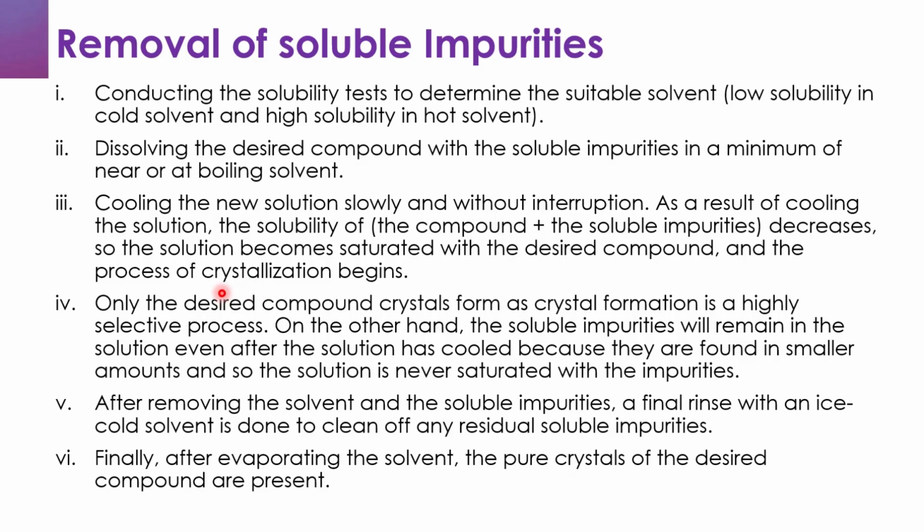What you also have to note is that only the desired compound crystals form, as crystal formation is a highly selective process. On the other hand, the soluble impurities will remain in the solution even after the solution has cooled, because they are found in smaller amounts, and so the solution is never saturated with impurities.